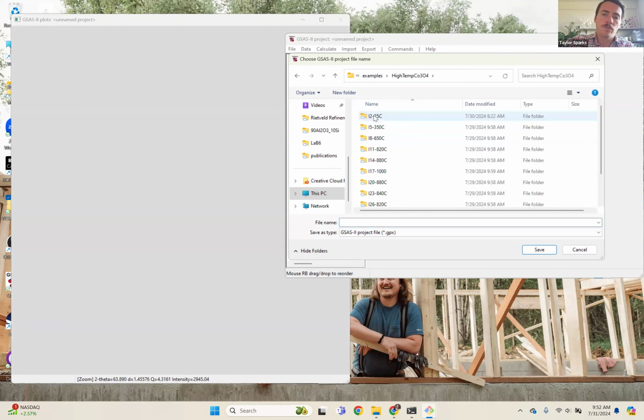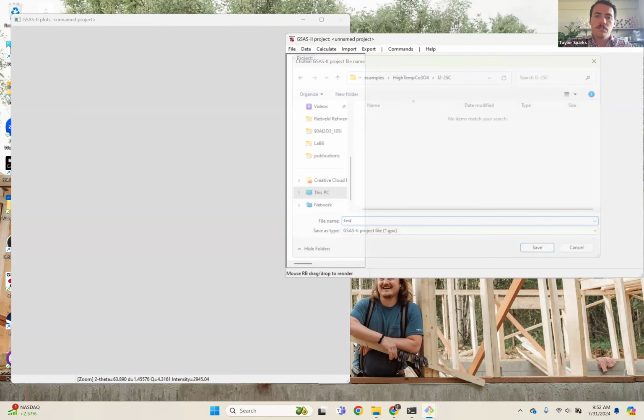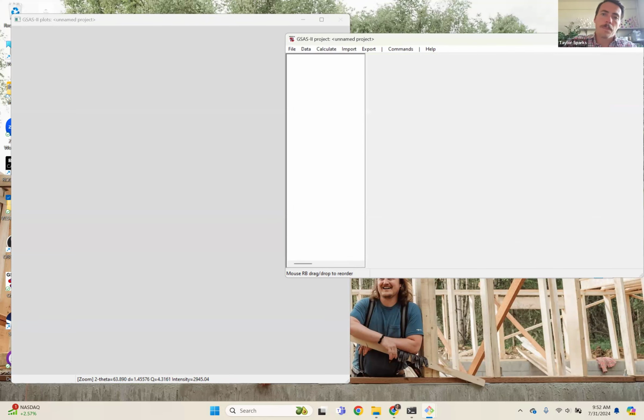And let's just open this first one, this 25 degrees Celsius. That's our very first lowest temperature run. So we'll just type in test. If we wanted to put it in a subfolder for just the refinement, we could have. I guess I didn't this time.